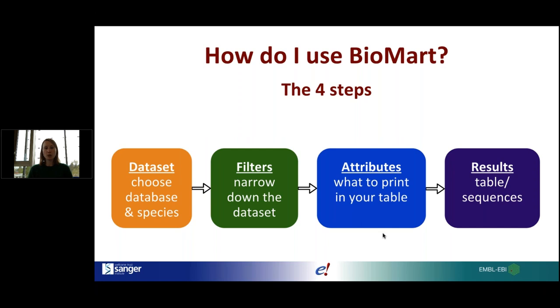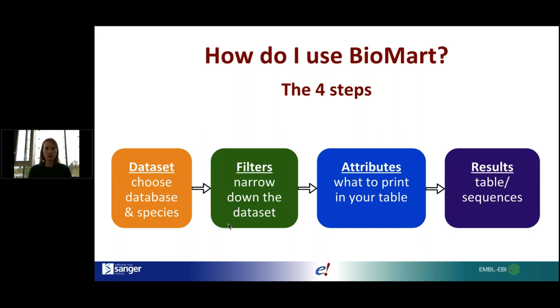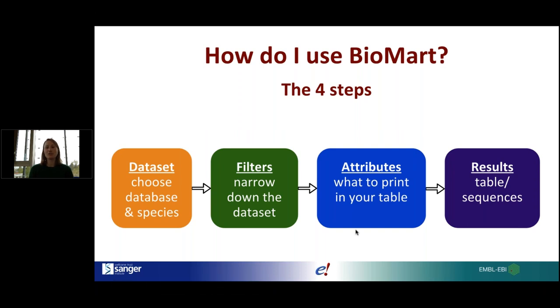There are four steps to setting up a query in BioMart. First, select the dataset that's interesting to you. Next, filter your dataset. After that, choose attributes. Finally, generate your results. Your dataset is the actual database within Ensembl that you want to search, and also your species of interest. Filters narrow down your dataset so you're only searching the relevant part. Attributes are the answers you want regarding your filtered dataset, and results can be in tabular format or as downloaded sequences.